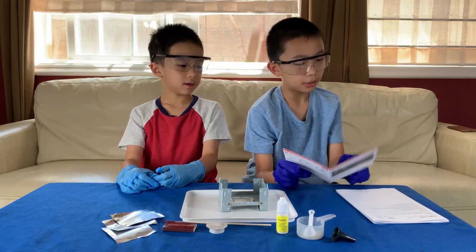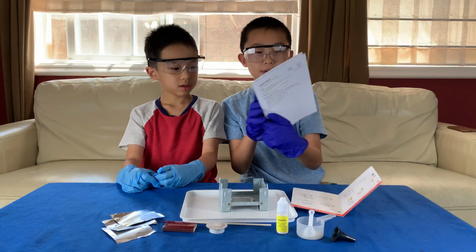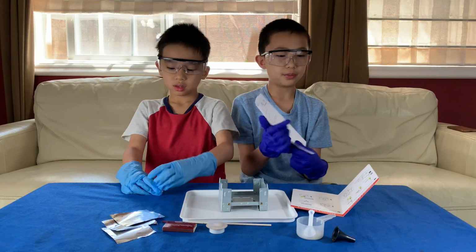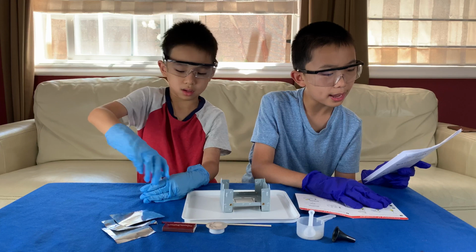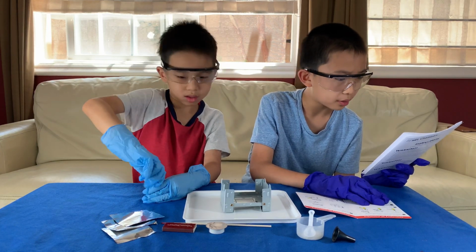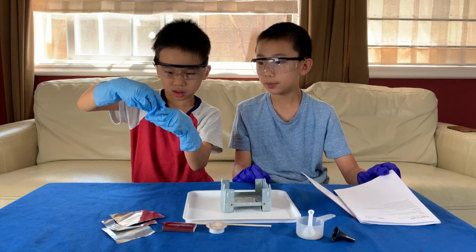Ready? So first we open a bottle. Oh, wait. I'm reading the instructions from here because these are also step-by-step instructions, but we'll use both to help us. Open a bottle of NaHCO3, that's baking soda, and insert the funnel into its neck. So we're opening this bottle.